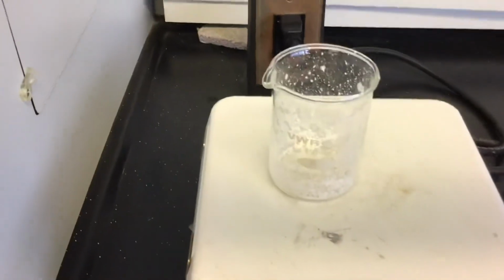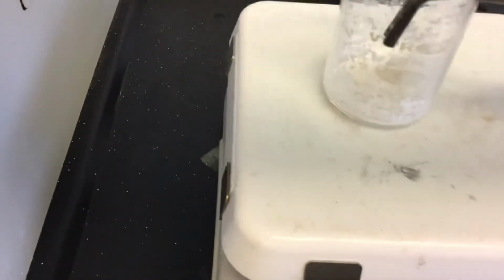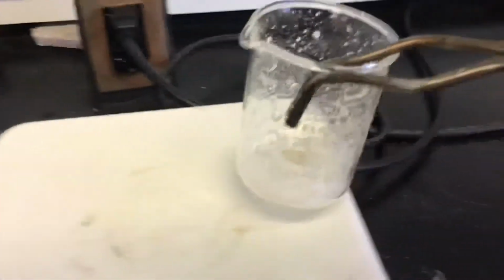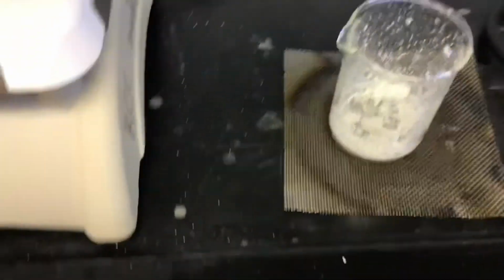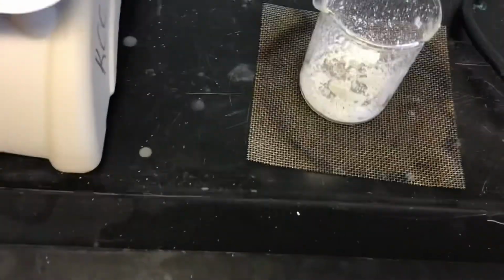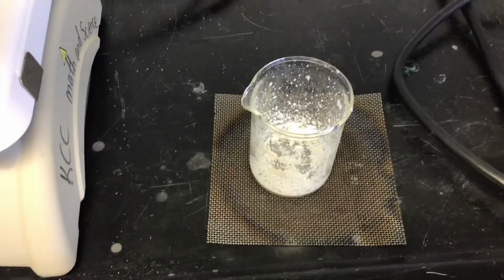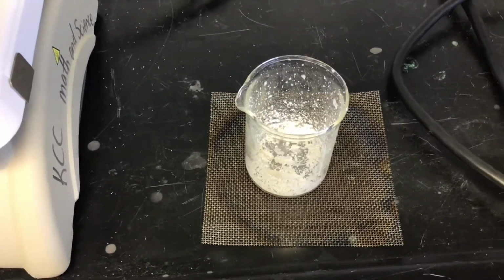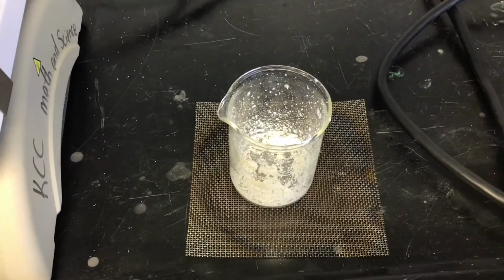Okay, it looks like there's no more condensation. It is all dry. So I'm going to take this beaker and put it on this wire gauze. Okay, so we're going to let that cool down. I'm going to turn off this hot plate. We're going to let that cool, and when it cools down, we will get the mass of that beaker 2 with the salt in it.